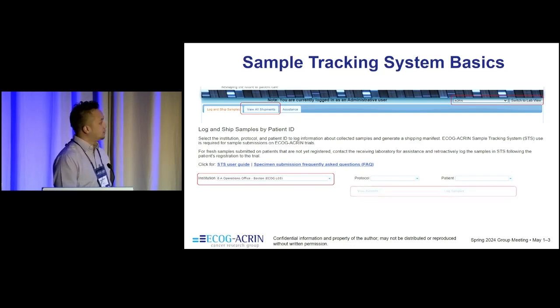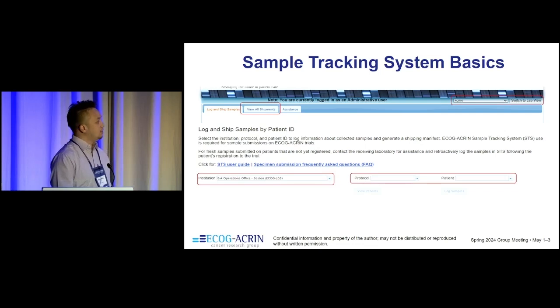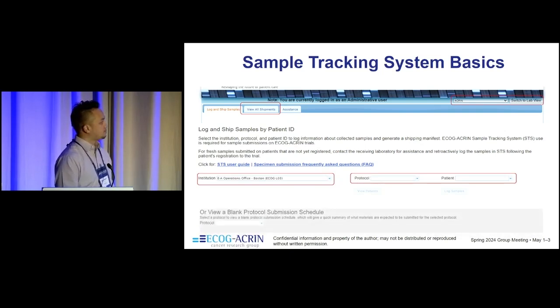The next part is the protocol and patient ID. So you can enter your protocol and then patient ID here. Access is specific to institution, so depending on what protocol you enter in there, this will allow you to log the samples.